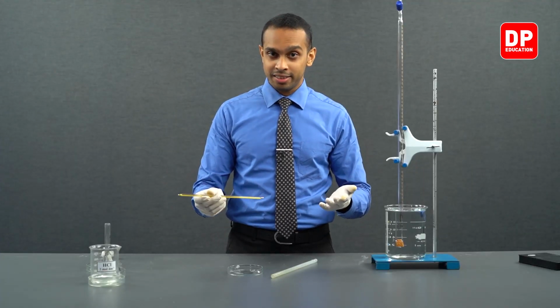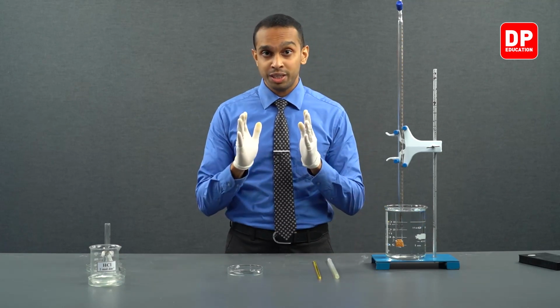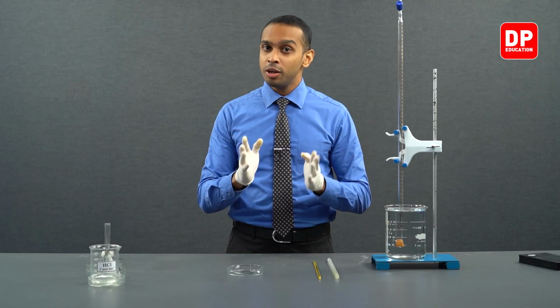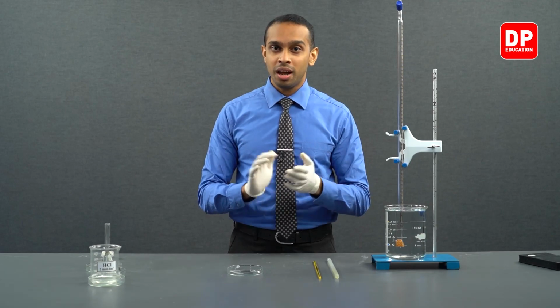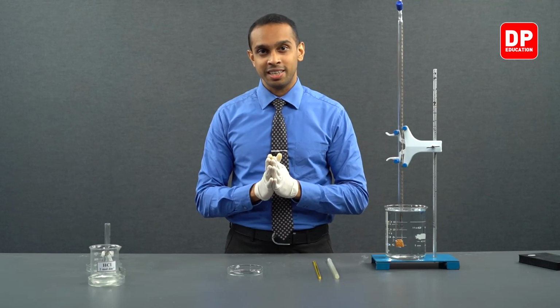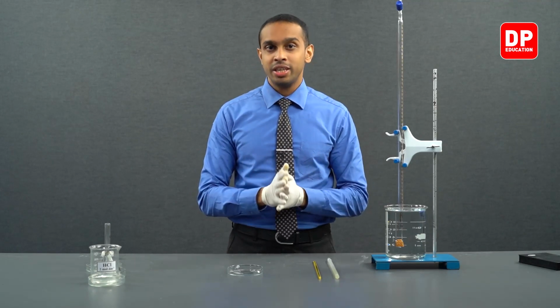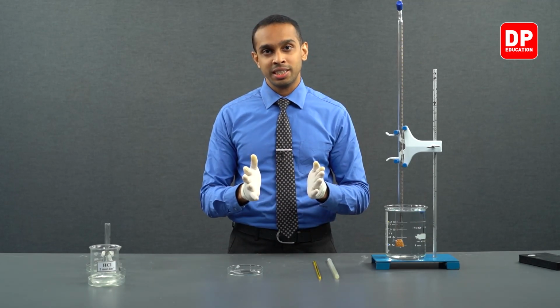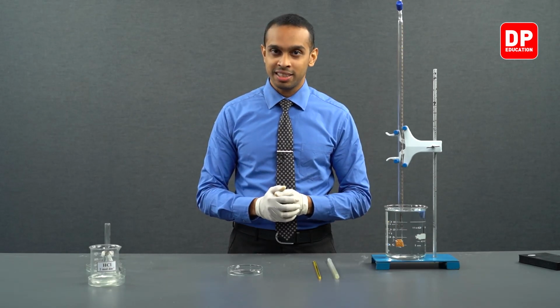After taking the temperature, we have now collected all of the information we need to calculate the molar mass of magnesium. However, we only conducted one test. Let's move on to another test so that we can be very certain of the measurements we have taken. So, we will repeat this test 2 more times. Using these 3 sets of data, we can calculate the molar mass of magnesium a bit more accurately. Let's move on to our second trial.